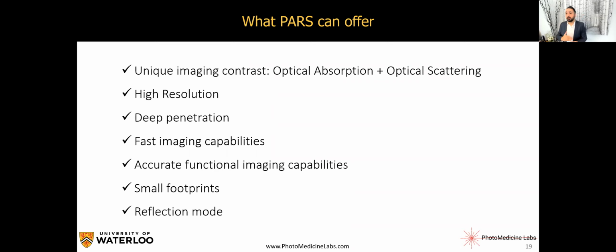We can have a very high resolution. Resolution usually is wavelength dependent, but we can achieve diffraction limited resolution in most of our cases. The lowest resolution we could achieve, for example, was around 250 to 300 nanometer, which is more than enough for us to be able to look at cell nuclei. But we are working on even super resolution methods, and we do have some patents on this idea.